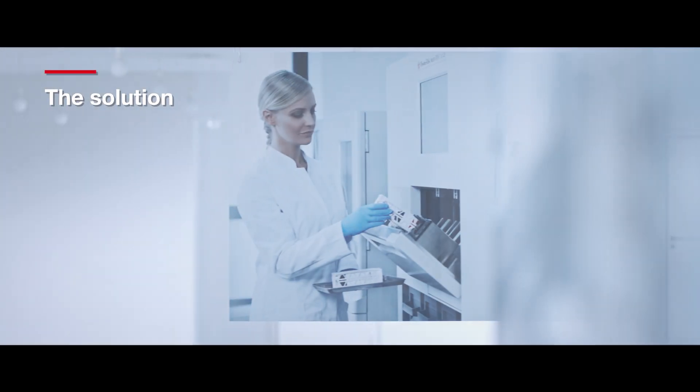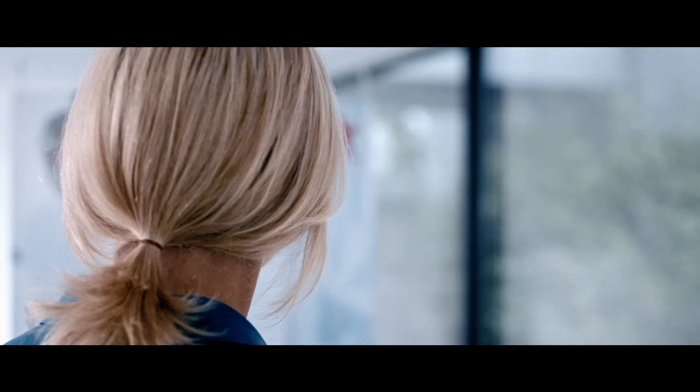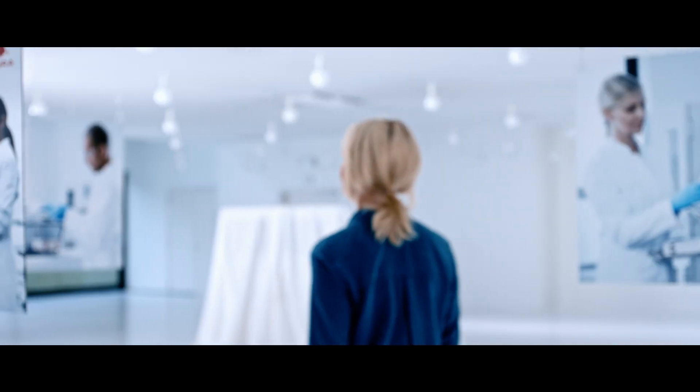It is stressful knowing that we cannot get our workflow efficiently and effectively completed on time. Imagine a solution where you can load any IHC or ISH slide at any time, on any station, on any instrument — an instrument that handles cases and single slides with the same turnaround time and lets you start staining on the fly. An instrument that gives you full control of your daily workflow.